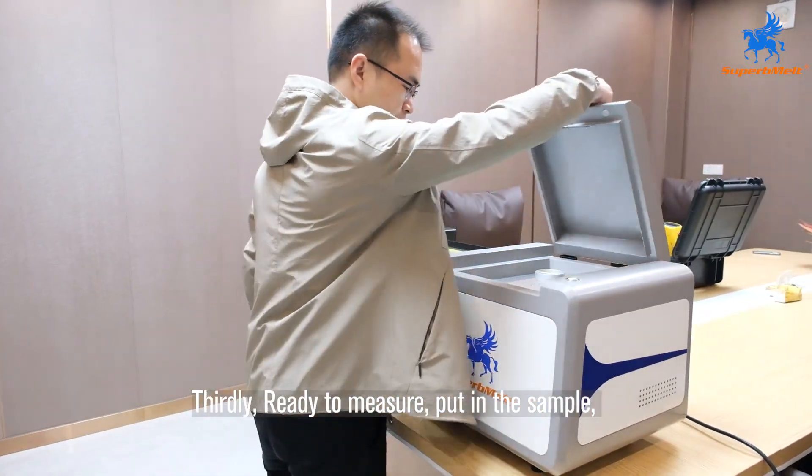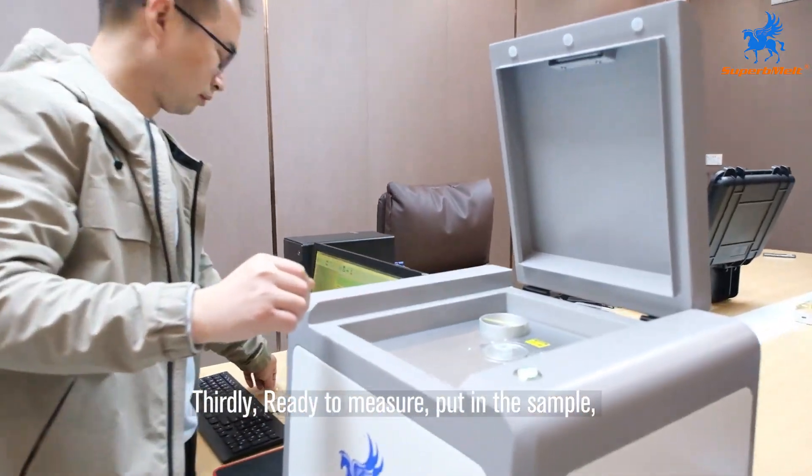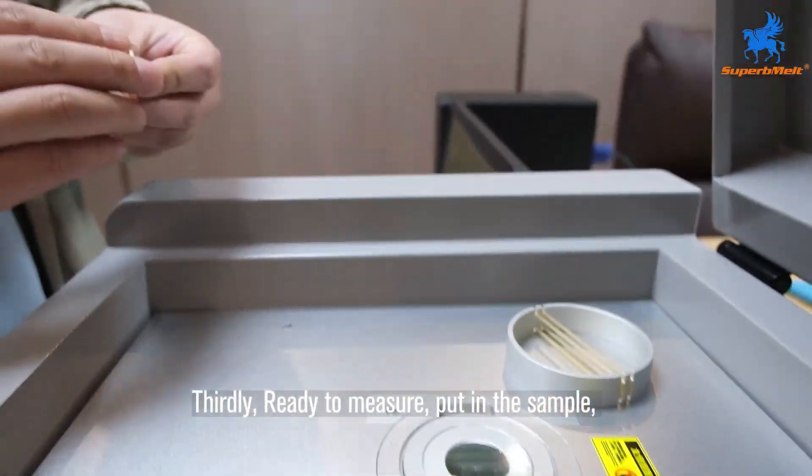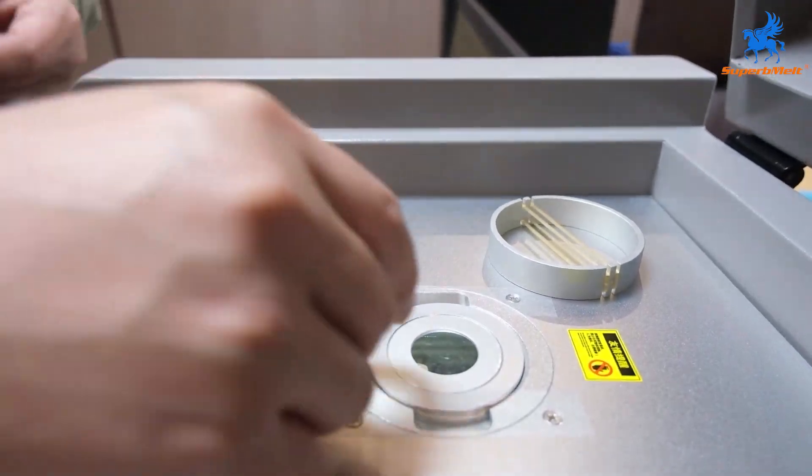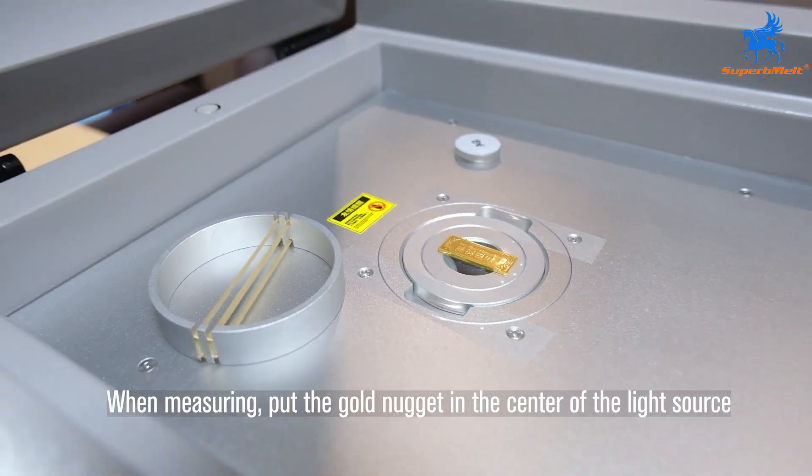Thirdly, ready to measure. Put in the sample. When measuring, put the gold nugget in the center of the light source.